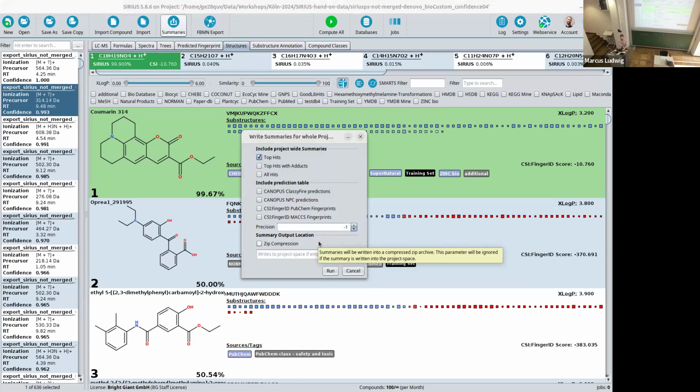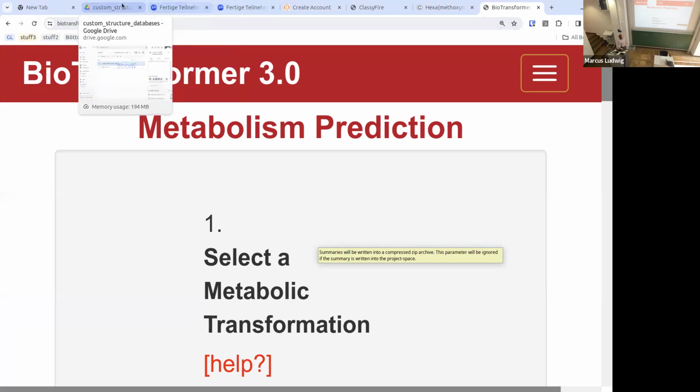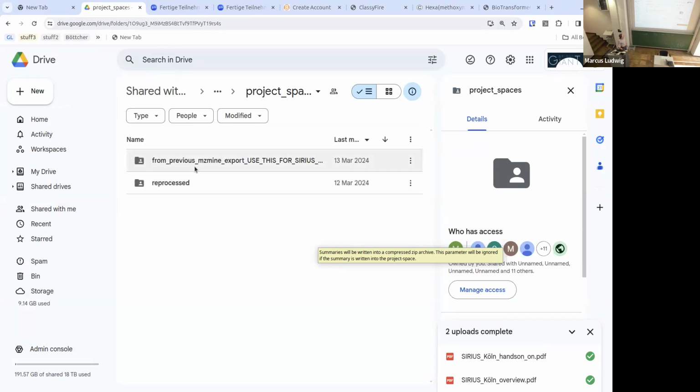The thing is, because the MZmine file changed in between, this is if you are now on the next day or today want to work further with it. I, in principle, already prepared it for you. You can also rerun it. So the new project.